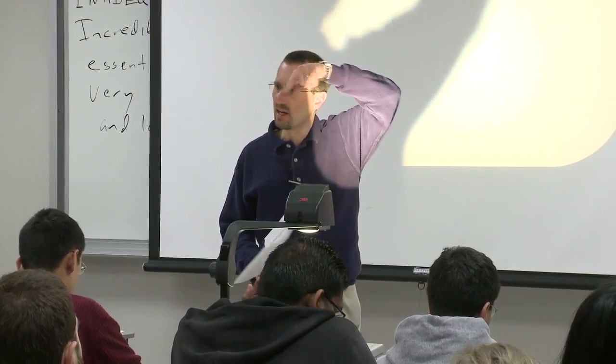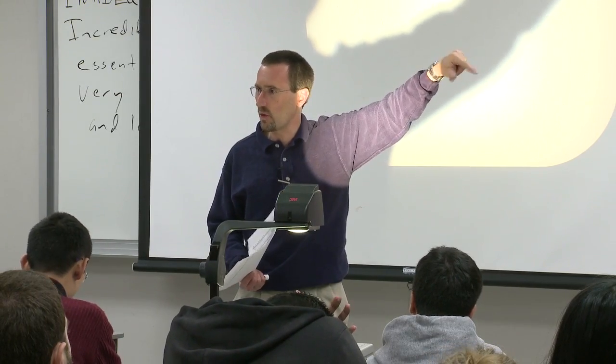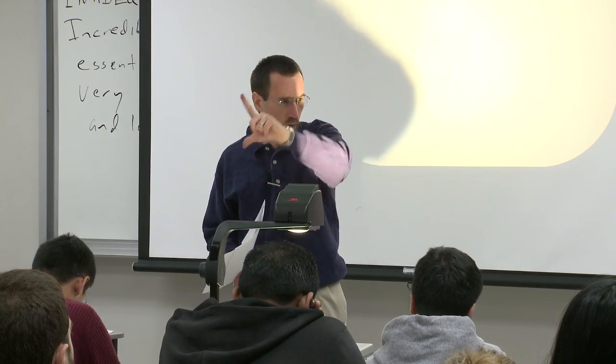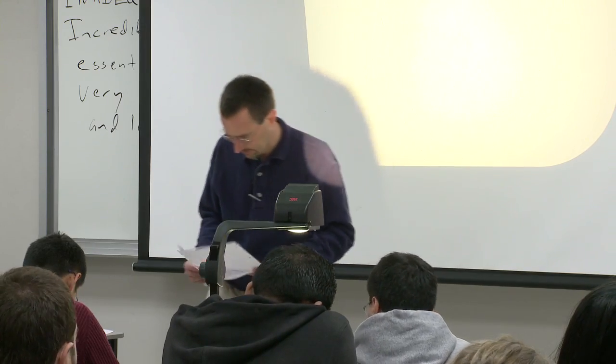So if I had a 5-carbon, just a linear chain with an isopropyl group at the end and a stereocenter way off 5 carbons away, chances are those two methyls would show up at the same position. But if it was just a couple of carbons away, probably at least in the carbon NMR, which is more sensitive, they'd show up at different positions.